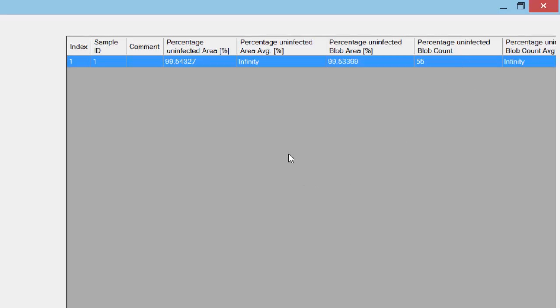And again, this is just a very simple example. We can put a lot more data in here, so we can show different points of roundness. We can show length, width. We can reject things. We can show it in red, green, whatever the requirements are. This software can do that. But this is just one of the applications.